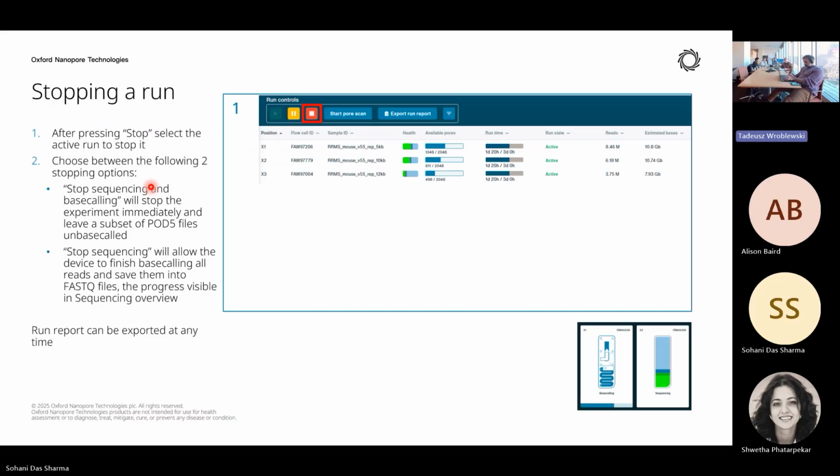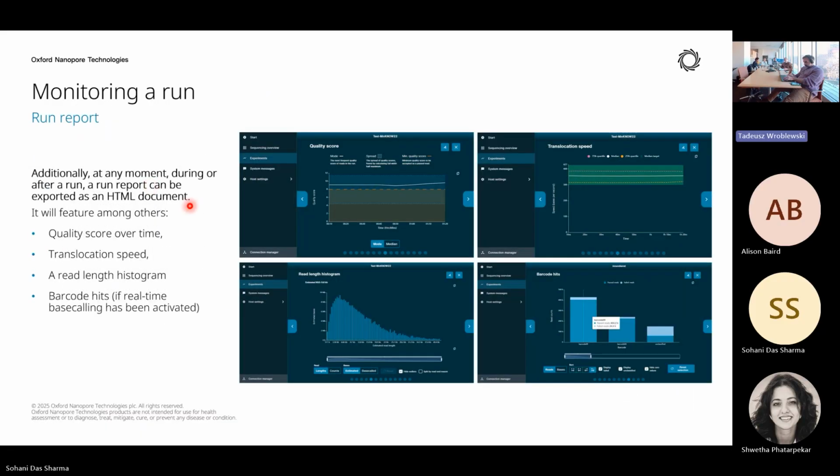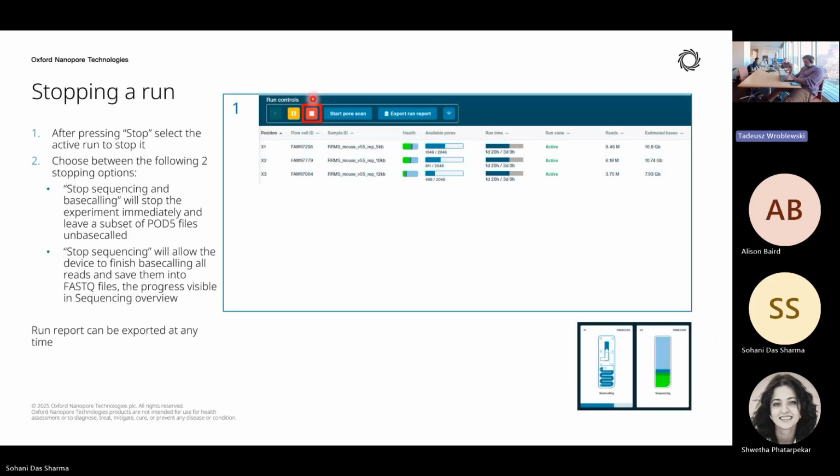That read length distribution was for gDNA? Yeah. Okay, good. It was not for the cfDNA. For the cfDNA I checked other reports, and it looks like what you are saying. So I think it was okay. The only thing I felt is that it was probably a little bit underloaded. We can improve that, but otherwise I think the run looked okay.